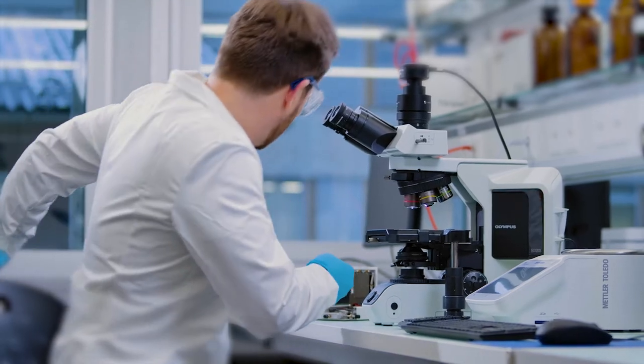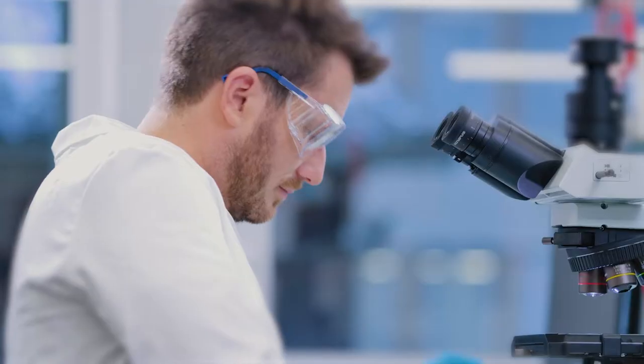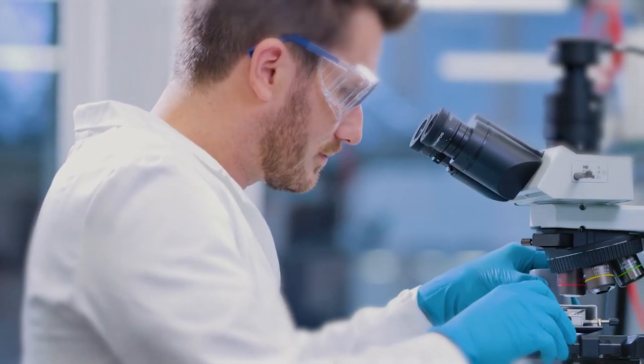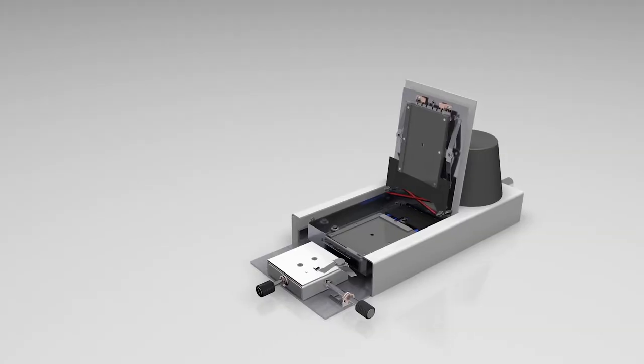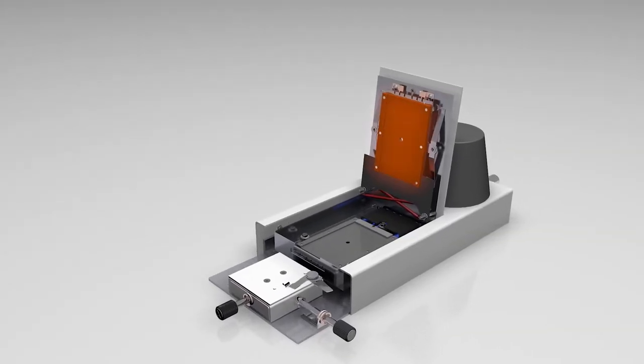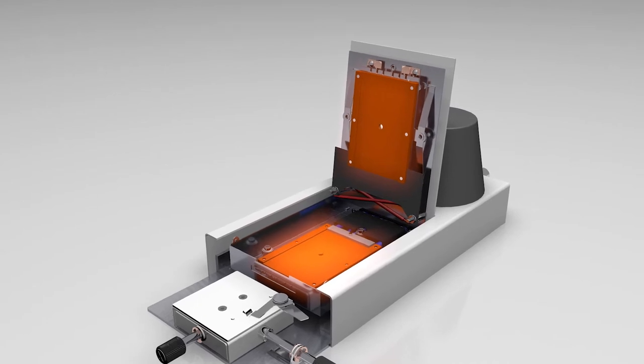Our excellence hot stage systems provide outstanding temperature homogeneity. The sample is heated from above and below, leading to reliable results.